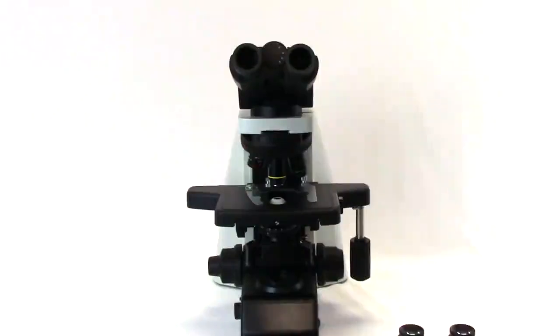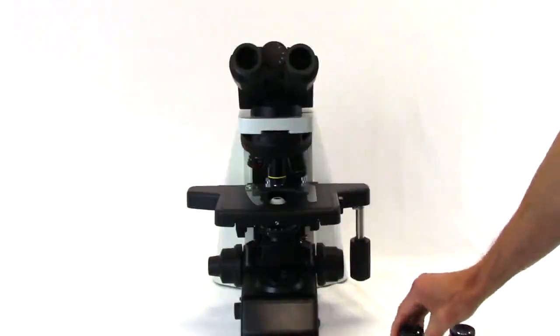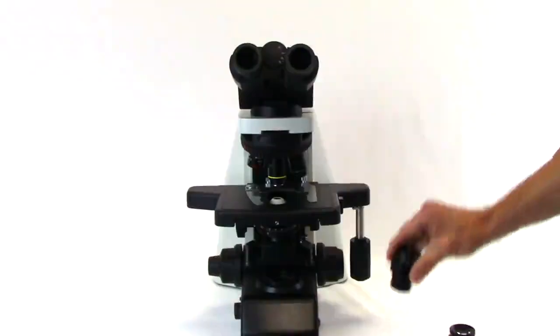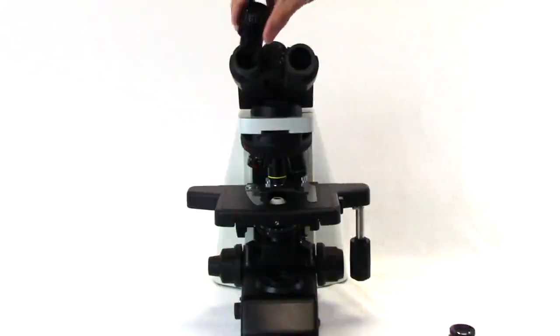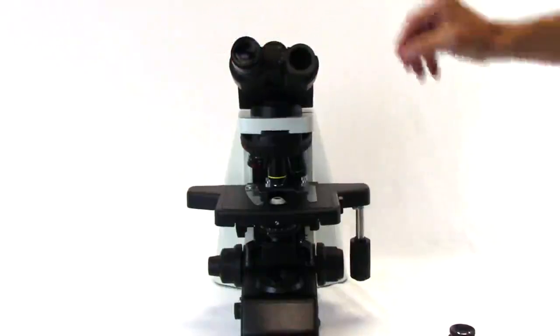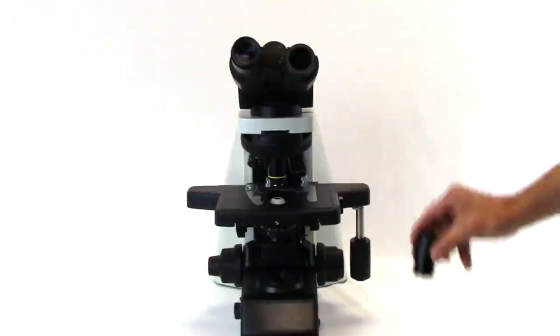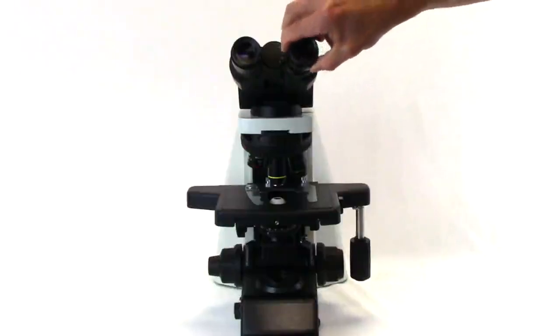Remove the dust caps from the eyepiece tubes. Insert an eyepiece into one of the eyepiece tubes. A gentle twist and push may aid in this process. Be sure the eyepiece is flush with the top surface of the eyepiece tube. Repeat for the other eyepiece.